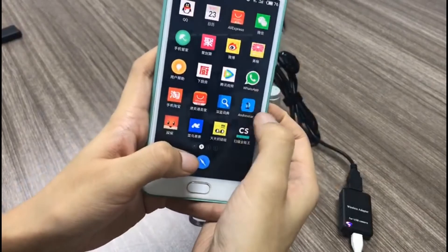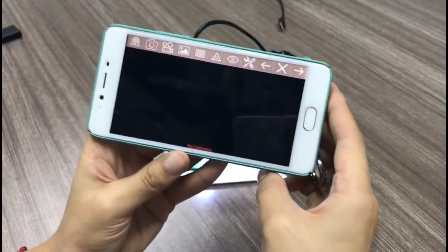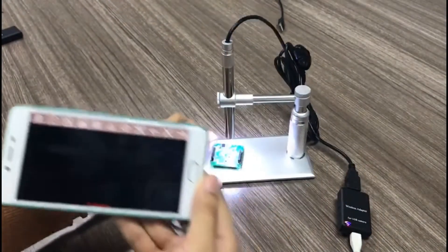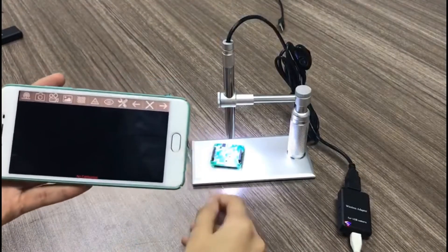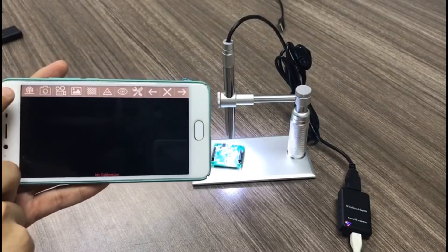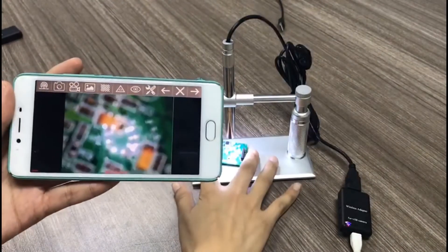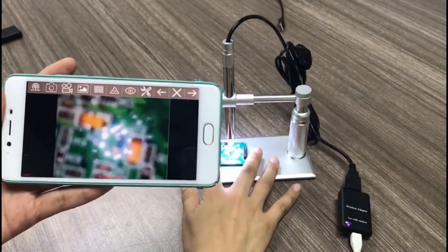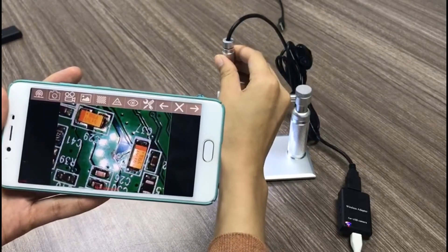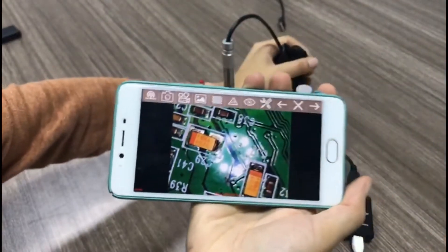Then you open the software — this one here, AndoStar. This is the interface of the software. This button here is to get the signal — it's like an on/off toggle. Now we get the live view from the microscope.